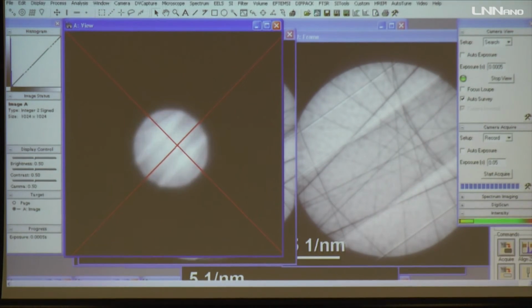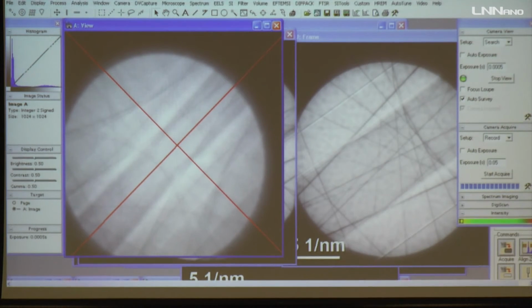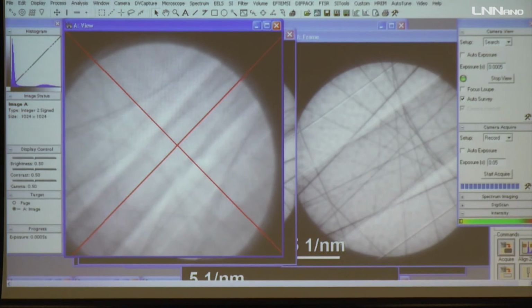And here, for understanding this thickness, we go to two-beam condition. Two-beam means one transmitted beam, one diffracted beam. The reason why we go to two-beam is simple. It's really easy to understand in the two-beam case. If you have many beams in your orientation, the calculation will become really very complicated, and you need to consider all the diffracted beams in your calculations. So it's simple if you go to a two-beam case and understand the thickness fringes.